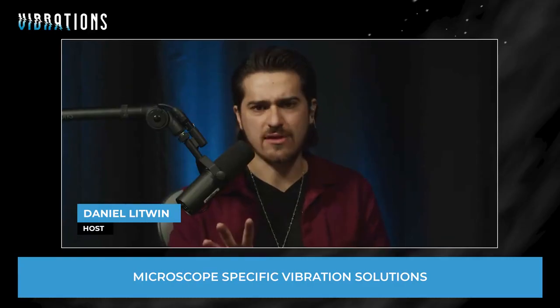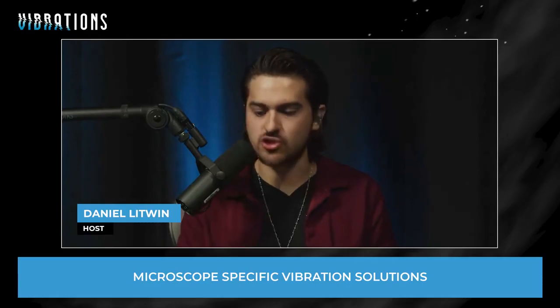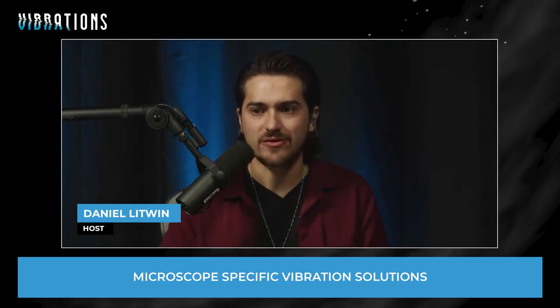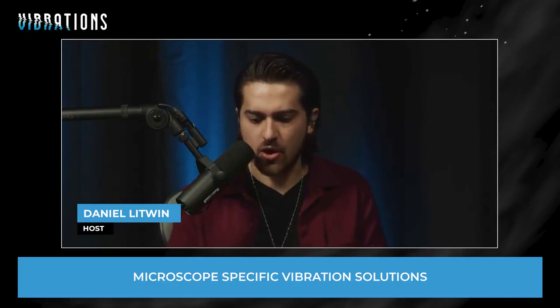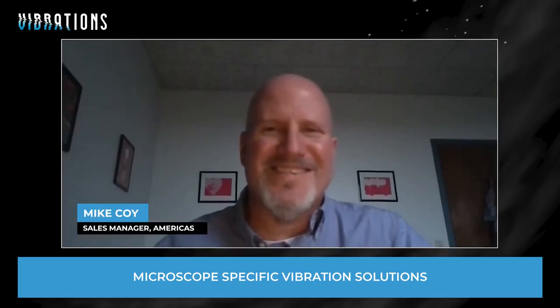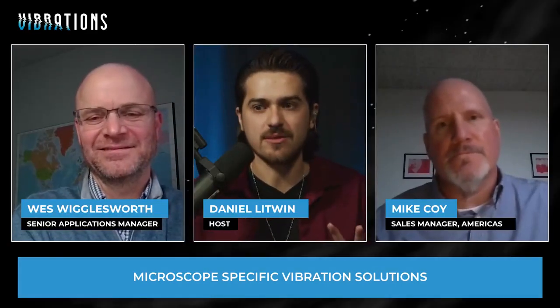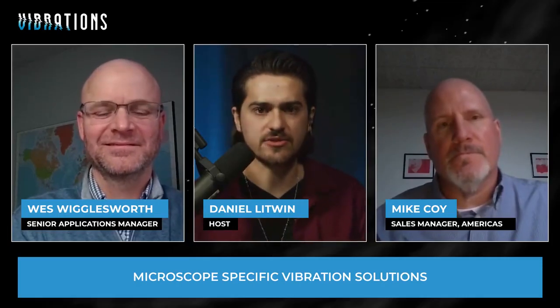Now, have you ever encountered a situation where an external factor, let's say a train or consistent construction, did actually interfere with lab equipment? Do you have an anecdotal story or a practical example you could give? Because it's kind of hard to uproot public transit or tell construction to go away. So the solution is going to be a little more nuanced and more to do with mitigating vibrations rather than addressing the root of the issue. So how does your team address some of those challenges?